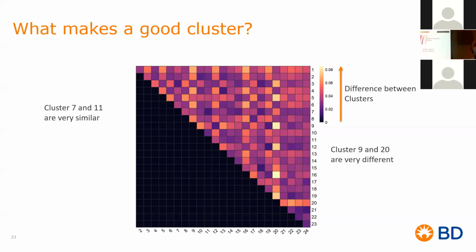Why is that important? And this is where being an immunologist is key in your multiomics experiment. If you gave this to a bioinformatician that's exclusively into bioinformatics, he'll know there's a difference, right? He could detect that. However, is that difference biologically significant? Because that is the real question as immunologists we ask. Is this even relevant, or should I not care?